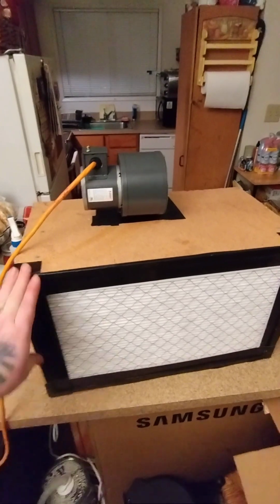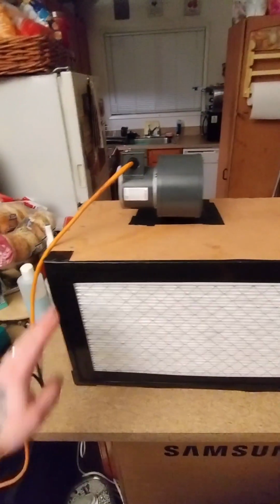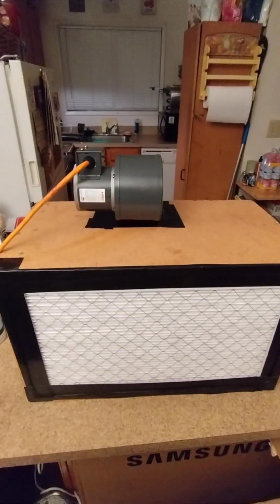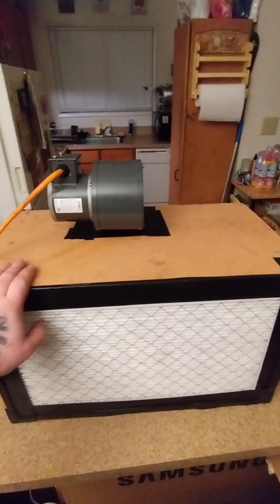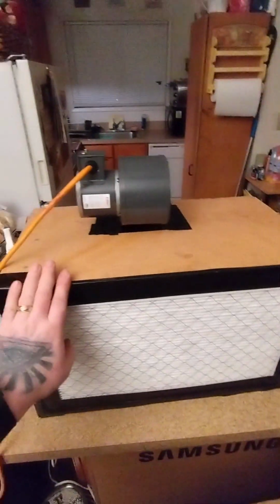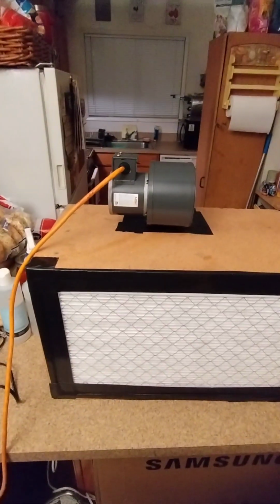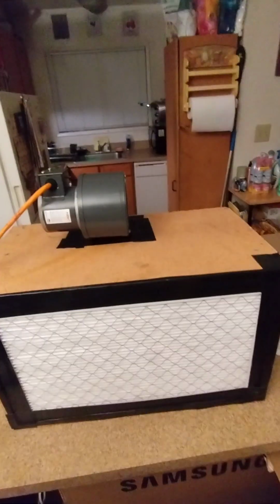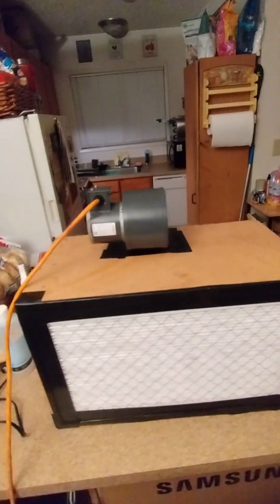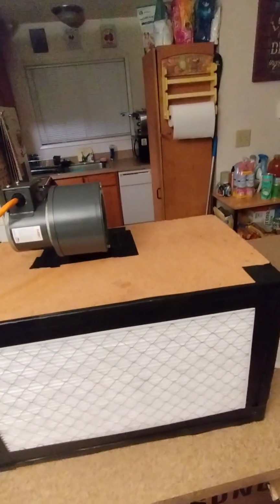Alright guys, this is my finished product of the Broke Boy laminar flow hood tech for under $100. Like I said, I paid $20 for this particle board, $80 for the fan. My sister-in-law stole the filter and the glue and screws, so don't go to Home Depot because they'll chase you. Go to Lowe's and have your sister-in-law, whoever, steal you some stuff.